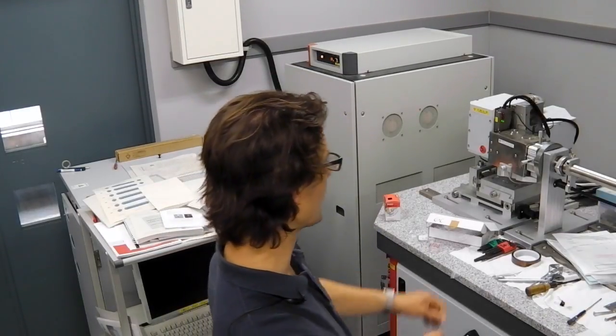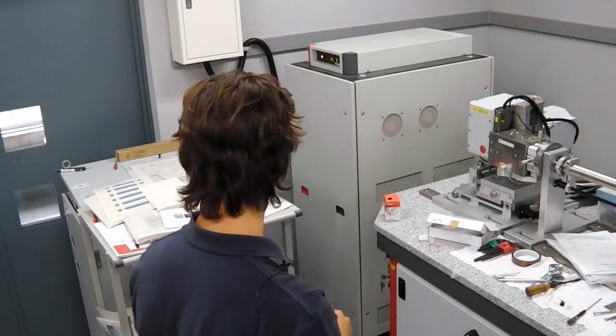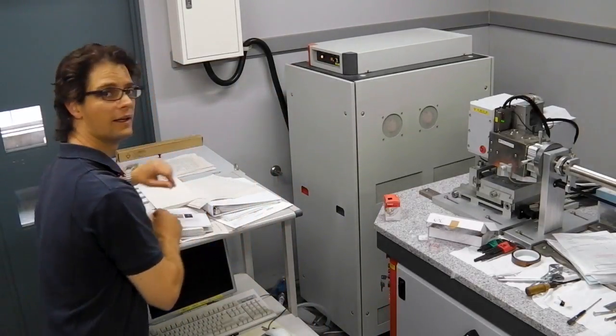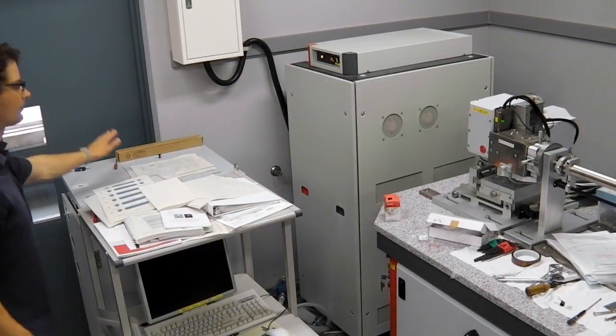Now this particular X-ray source is a rotating anode type. It consists of three components. We have the actual X-ray source over here, the high voltage power supply here, and the cooling system right over here.